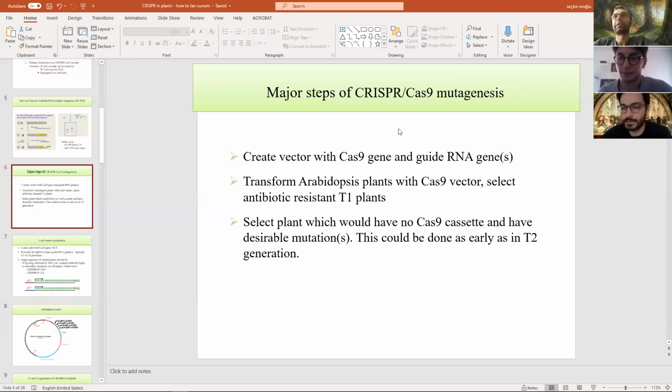Okay. So, Sezgin, you should also do this. Then it's easier. What if you don't do this? You'll have PCR products. Some of them belong to mutant alleles, some of them may be wild type alleles. The only way then to understand where the mutation is, is to sequence this band. So it's also a very frequently used technique. And if you have a lot of money and time, it's maybe more efficient than the technique we use. But I think we don't need to spend so much money on sequencing every product.